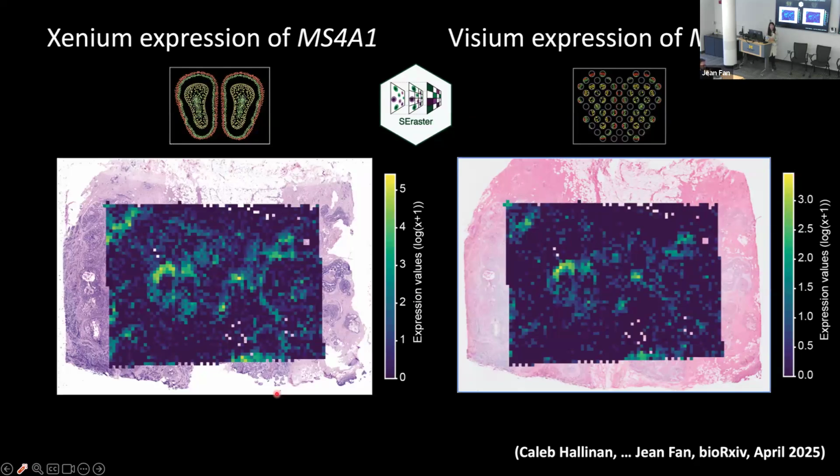Yes. Do you assume expression of the empty gap, or do you just aggregate all of the sampling spots? Great question. Yeah, if we're aggregating to a really coarse resolution, we would be missing things in the empty spots. So in theory, if there's more expression in those empty regions that are not captured by the Visium, we should see slightly more detection in the Xenium for the matched locations. Great points. But for the most part, they do look quite similar.